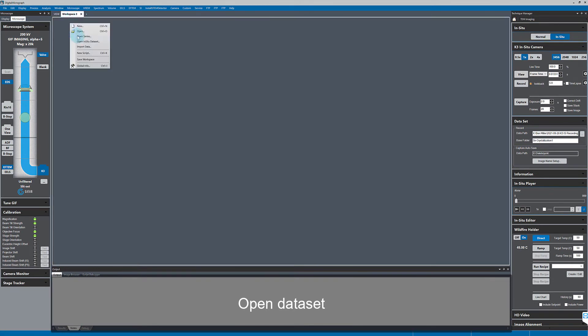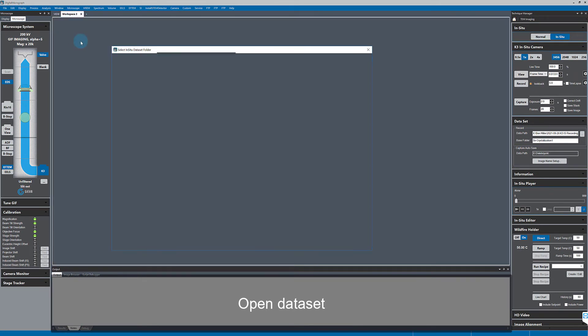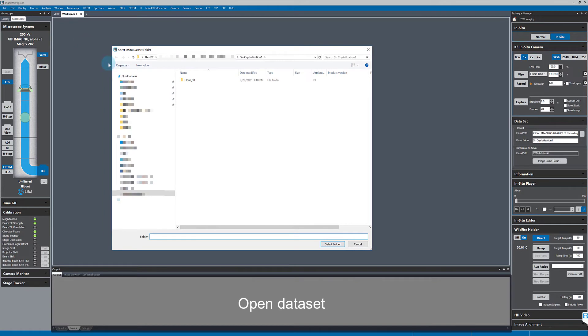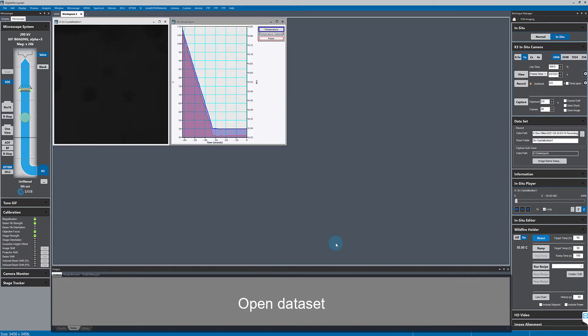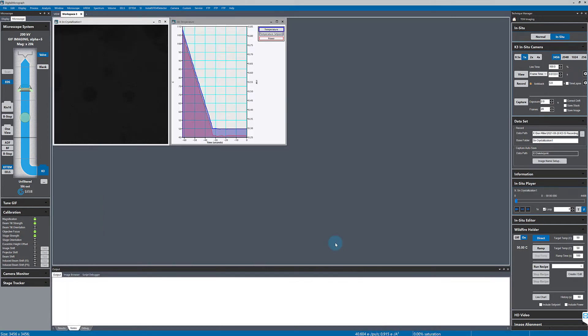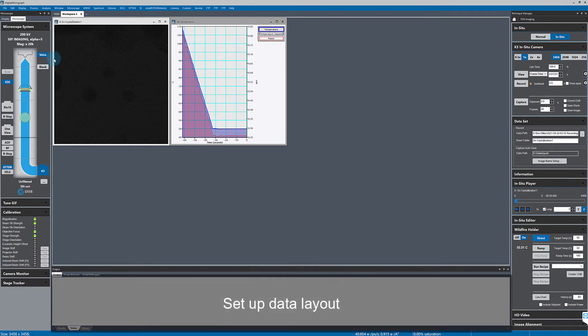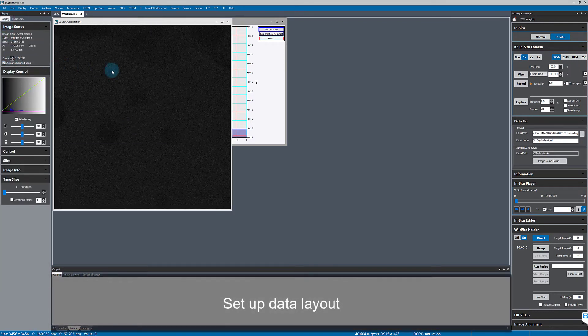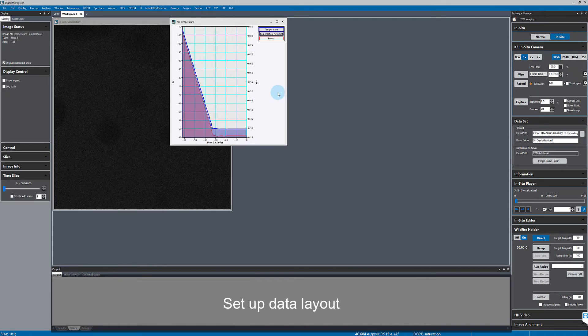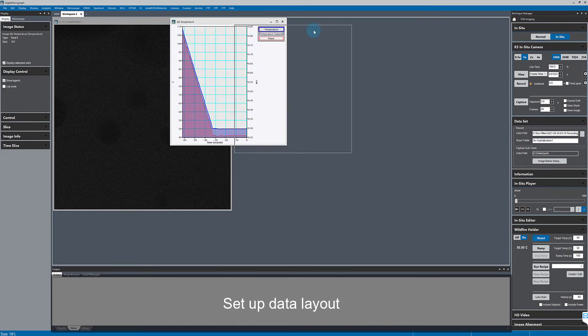The software takes me straight to the right location, and so now I can play back my data. I'll set the zoom level of the display to be a simple fraction and turn on the live FFT as well.